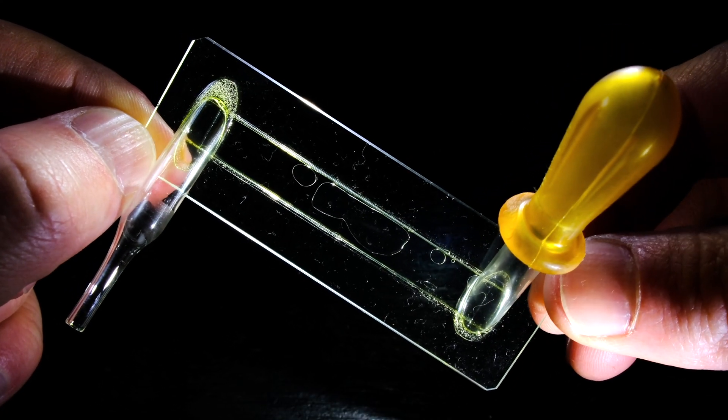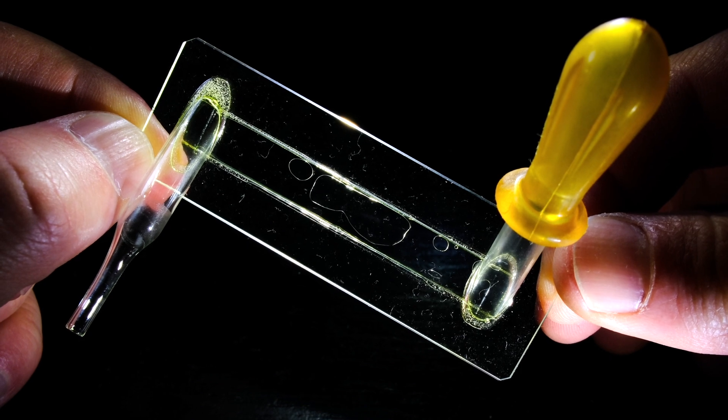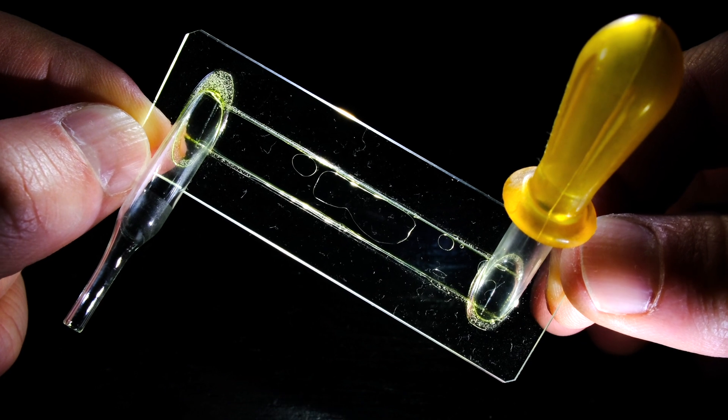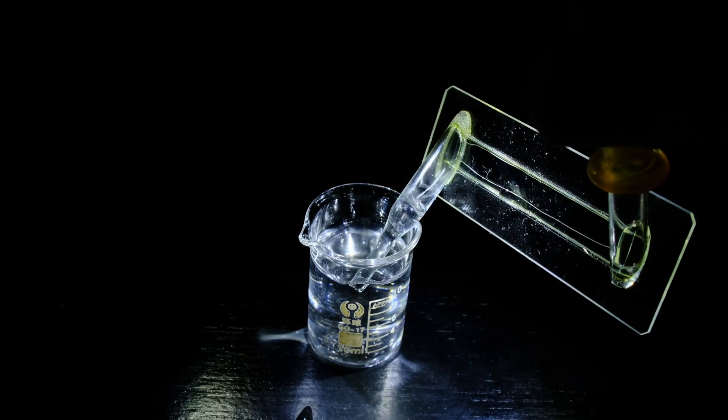Hello and welcome! Today I'd like to show you some very useful microscopy equipment I discovered recently in a more or less 40-year-old book. I came across this thing here. It looks a bit like an odd piece of modern art, but actually it's quite useful.